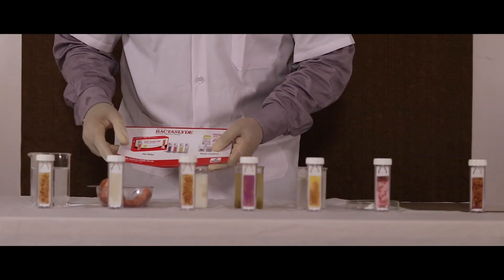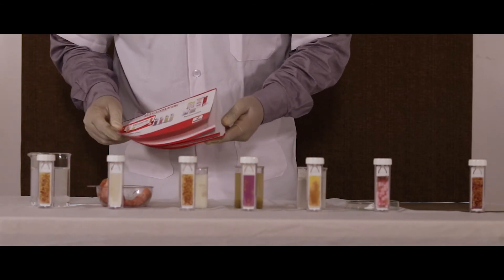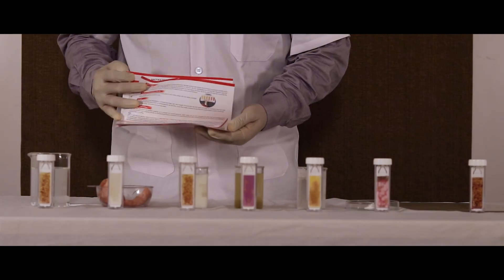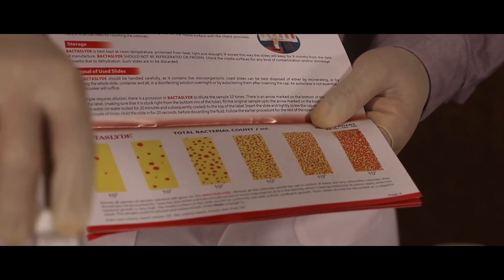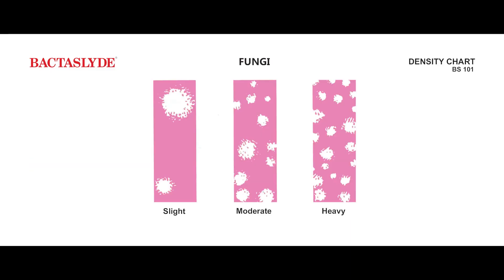These are the results formed after 18 to 24 hours of incubation. Compare your results with the respective density chart to conclude the estimated count of bacteria.